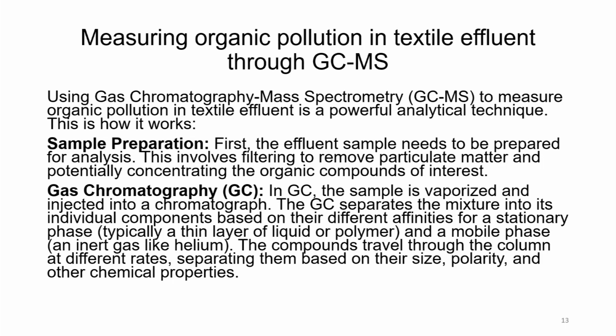Sample preparation: first, the effluent sample needs to be prepared for analysis. This involves filtration to remove particulate matter and potentially concentrate the organic compounds of interest. So, in GCMS, there is a very specialized step of sample preparation. The sample cannot be just taken like this and analyzed, unlike what we do in COD and BOD and TOC.